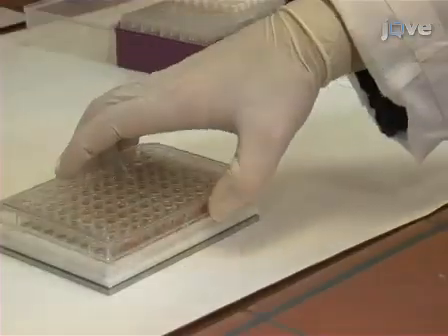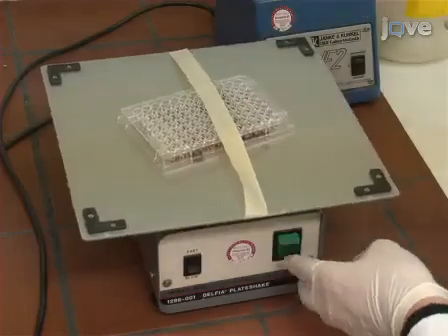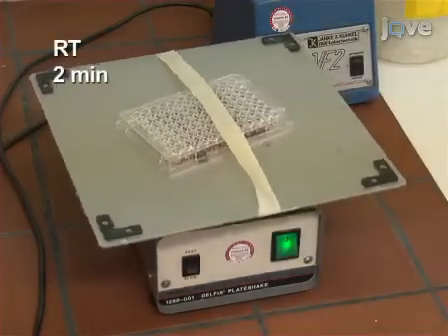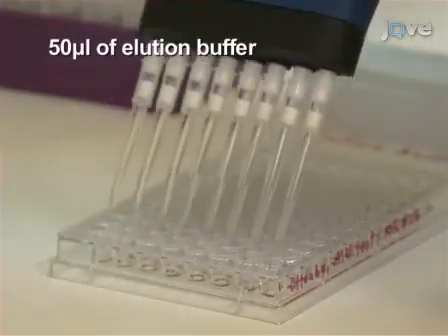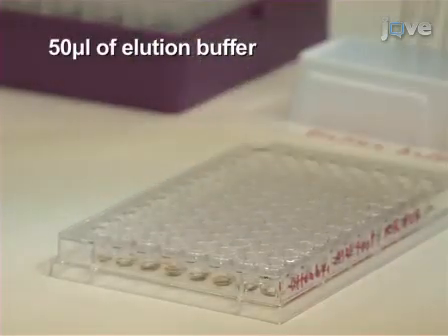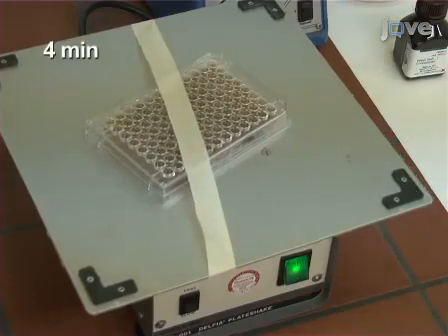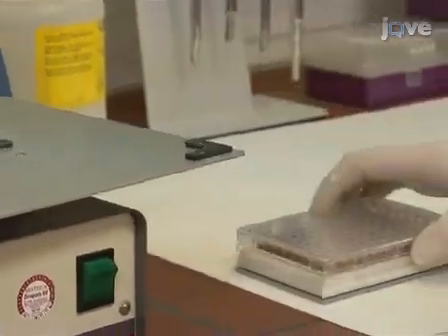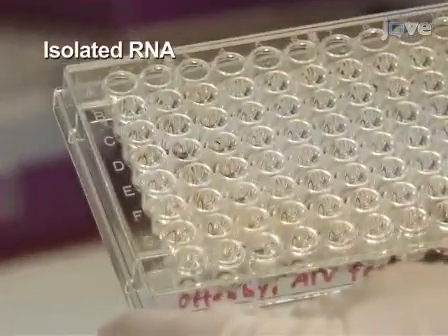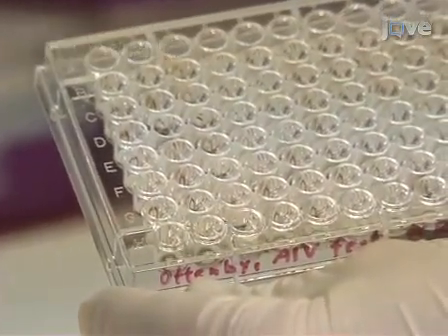After the last wash, use a pipette to remove as much of the solution as possible and place the dry plate on the shaker for 2 minutes at room temperature to air dry the beads. Once the beads are dry, add 50 microliters of elution buffer from the kit and shake for 4 minutes to release the RNA from the beads. Capture the beads as before. The supernatant now contains the isolated RNA, which is ready for downstream applications.